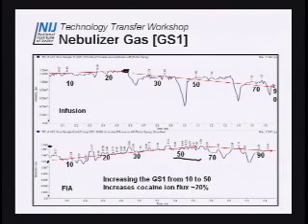Infusion, remember, that's sort of your ideal situation. Flow injection is real sample coming off in a real LC program. Okay, so the bottom one is best, reproduces what's happening when your sample's coming off the column. All right.